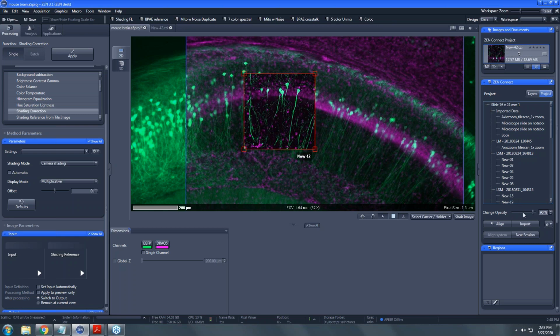If you want to get crazy with it, you can take a snapshot of your lab book to see what your protocol is and correlate that with the slide that you captured, whatever it is that you'd like. Of course, if you want to use it for the intended purpose of correlating images off your optical microscope with some other system, that's great too.